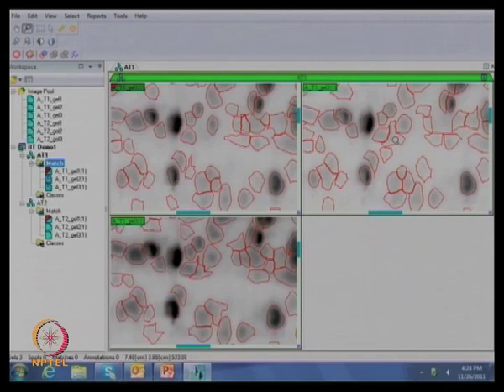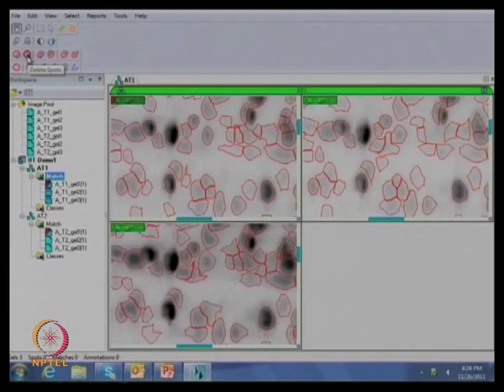You can see there is, I think you can't see there is a protein, but it is showing as a protein. One can delete this kind of spots also. One has to go to edit the spot. There is an option like edit enable. Go there and just delete the spot. Wherever the spot you would like to delete, this particular spot I am not interested in, then I can delete it.